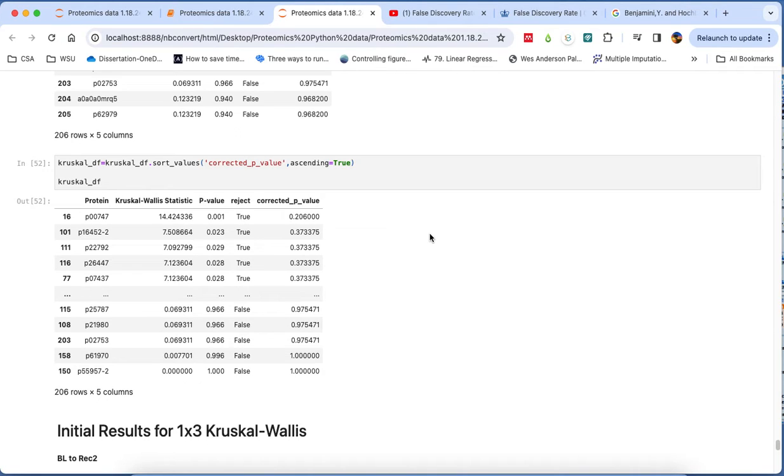There are no significant proteins identified, so I just wanted to reach out and try to get the ball moving and see if there are any other suggestions to try. This was my first swing at this.